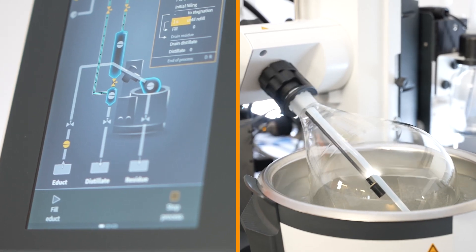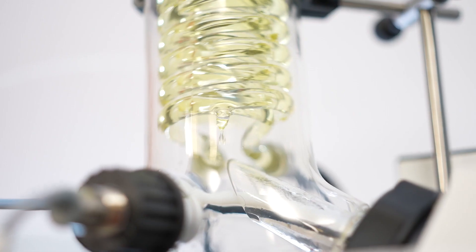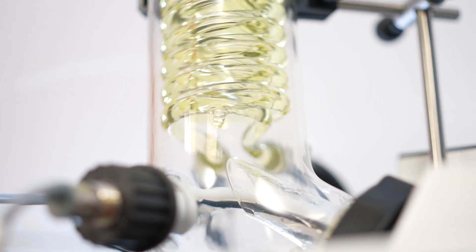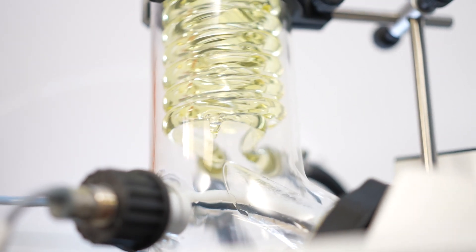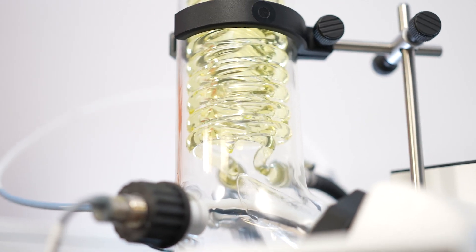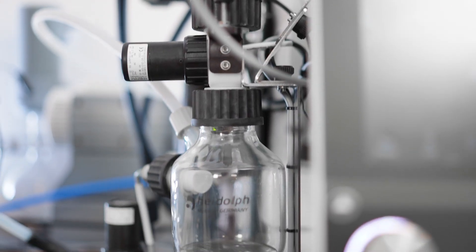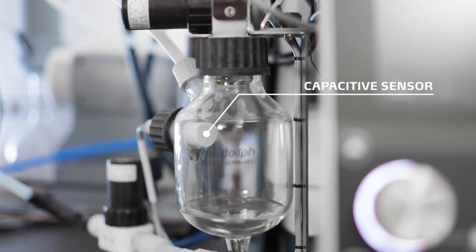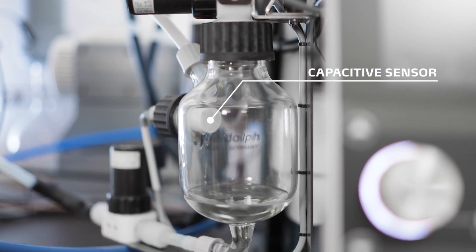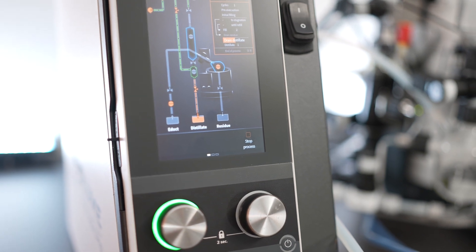There is an initial filling at the beginning of the process and seconds later the evaporation takes place and the first solvents get collected inside the receiving vessel. This vessel is equipped with a capacitive sensor to detect the filling status.